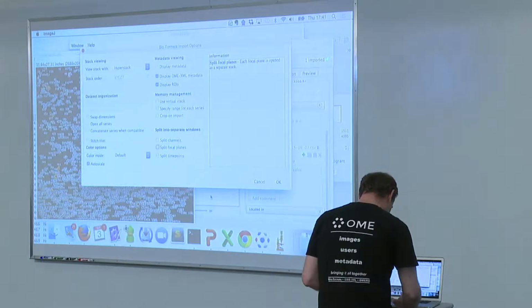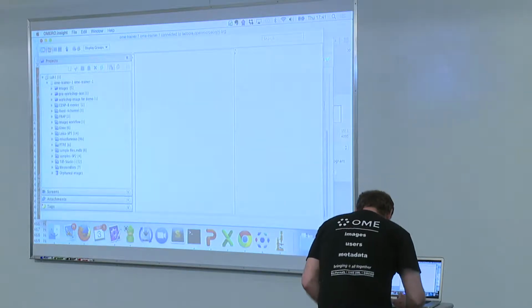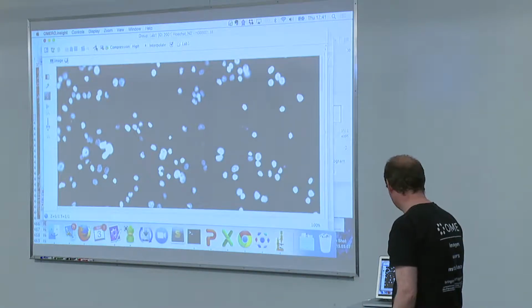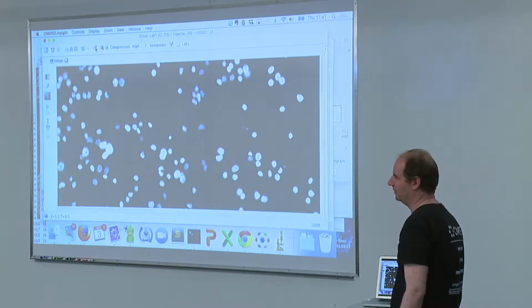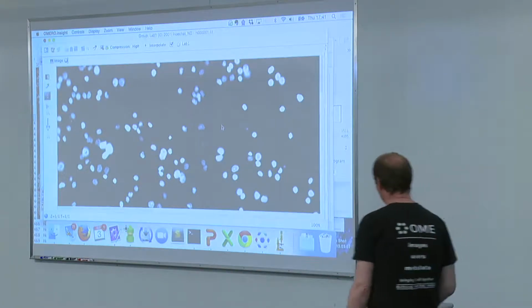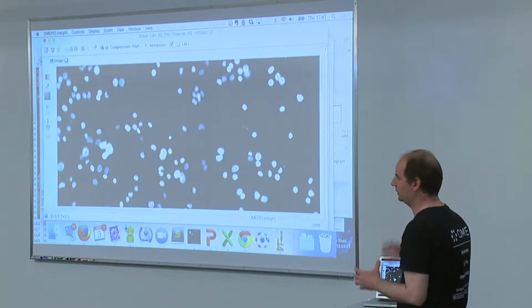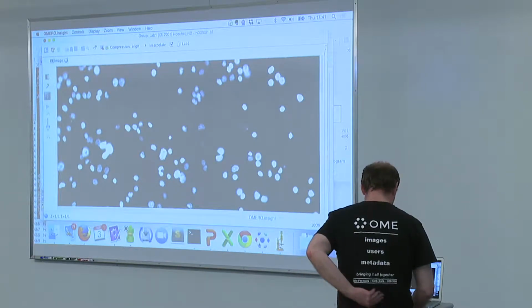Right. So if I go to OMERO Insight just quickly, this is the workshop image for demo. I forgot one important thing. As I'm showing you the regions of interest, you can draw regions of interest in OMERO as well. You don't need ImageJ for that, but of course ImageJ has incomparably bigger power in the analysis tools you can use on those images. And that's why we are doing this connection and going into the effort of using ImageJ as a client, in fact.